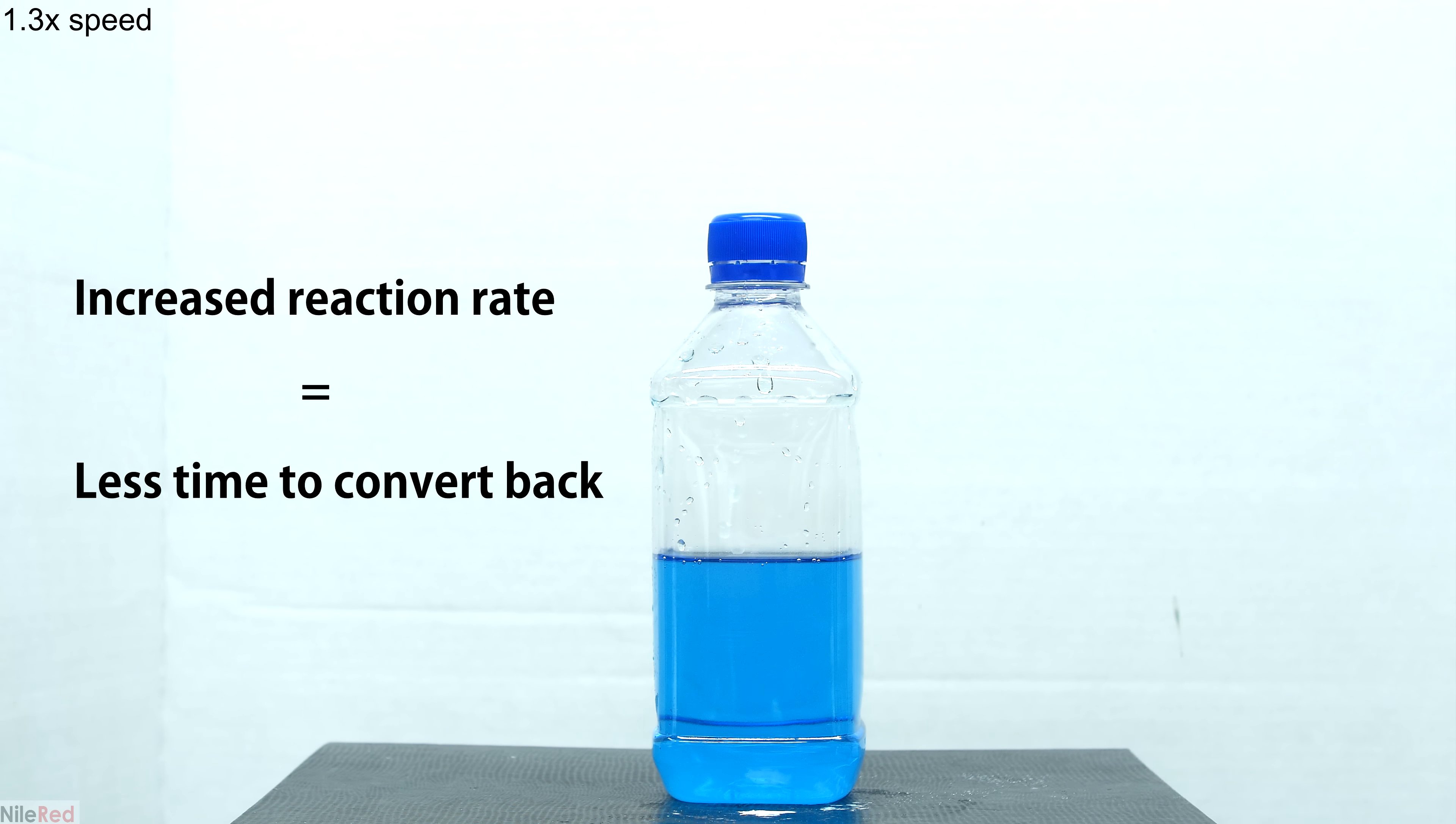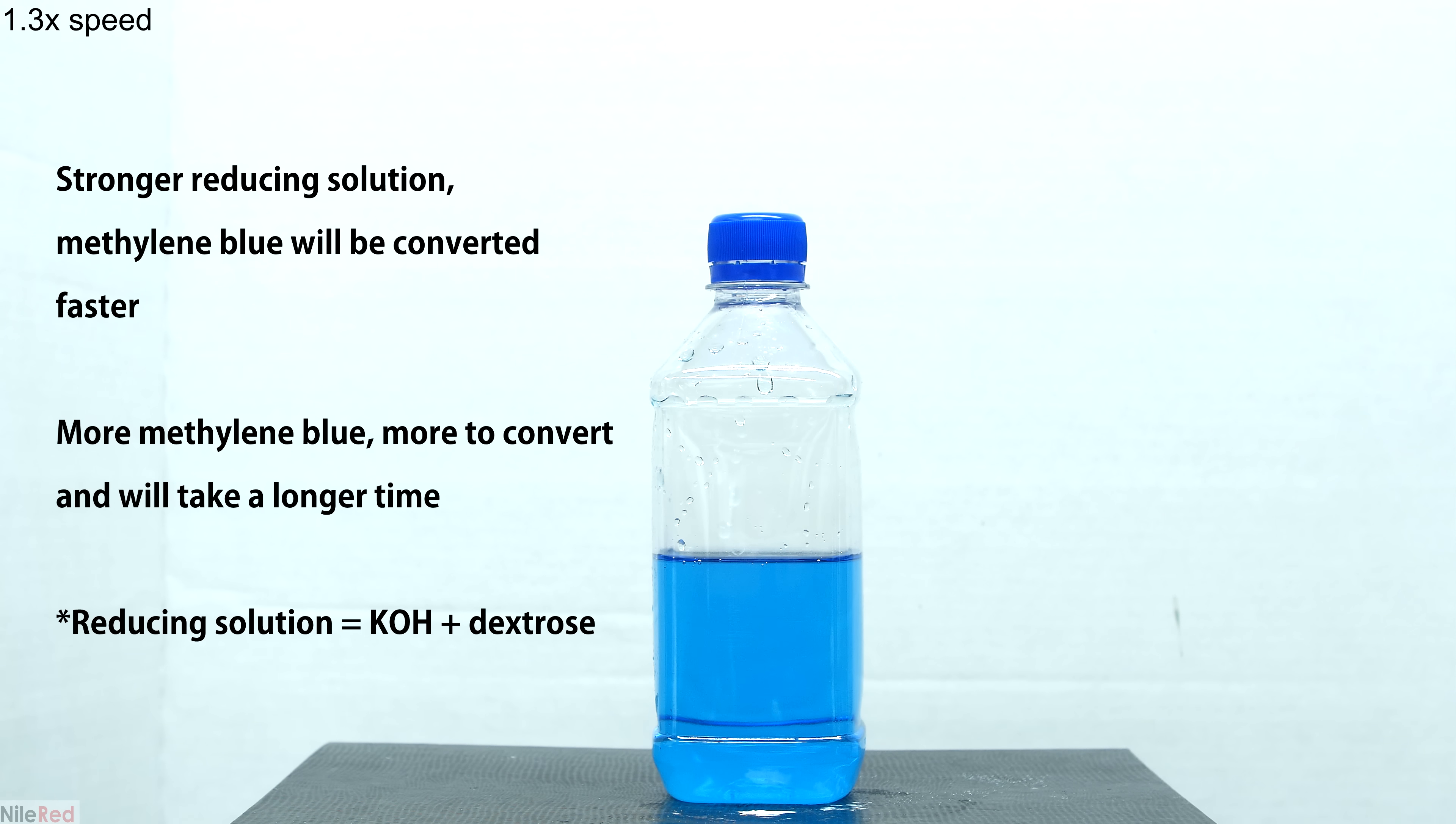If the temperature is increased the molecules are going to be moving around much quicker and for this reason the reaction rate will increase. Depending on how we play with the concentrations of the reactants we can either speed things up or slow things down. If we increase the concentration of our reducing solution things should speed up but if we increase the concentration of the methylene blue things are going to become slower.